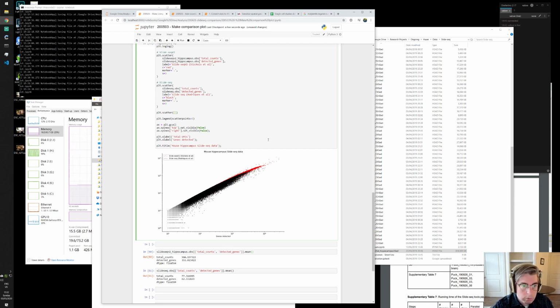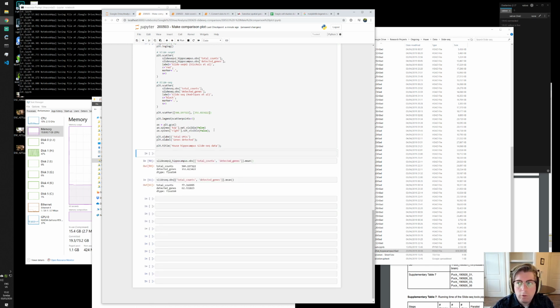So this point is going to be Slide-seqV2. X, Y. Just going to check what that looks like.